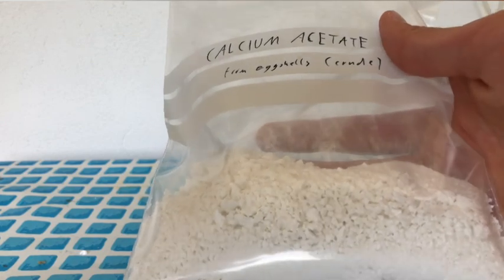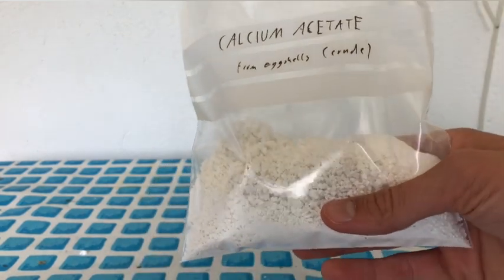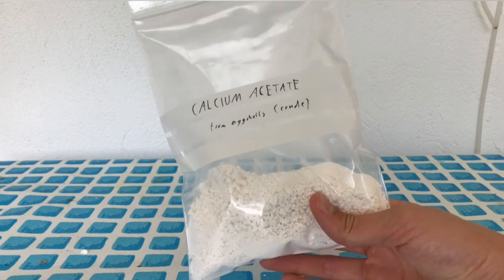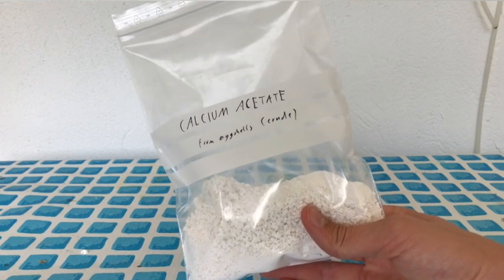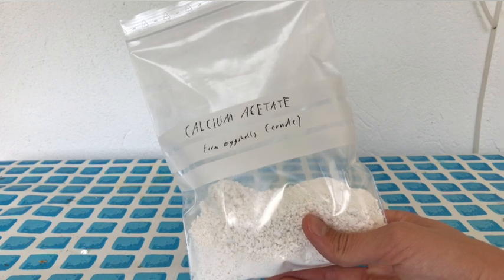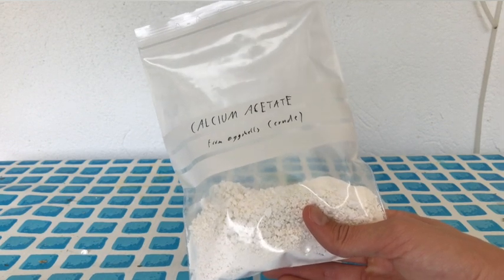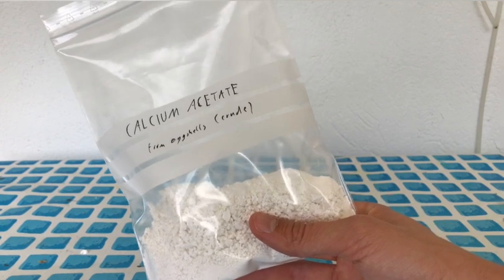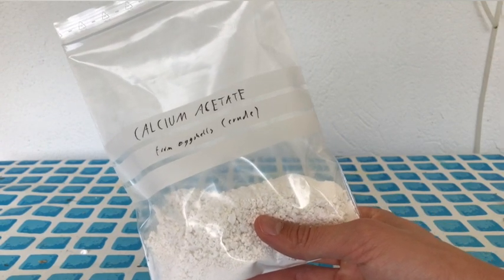In total we collected 98 grams of calcium acetate. And what can you use this stuff for? Well, you can use it to make acetone, you could make alcohol jelly, but we are going to make acetophenone from calcium acetate and calcium benzoate, because this topic hasn't been covered that much on YouTube before.